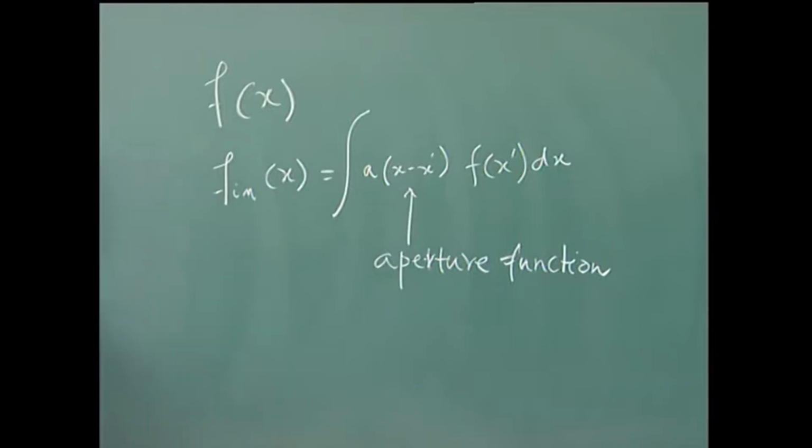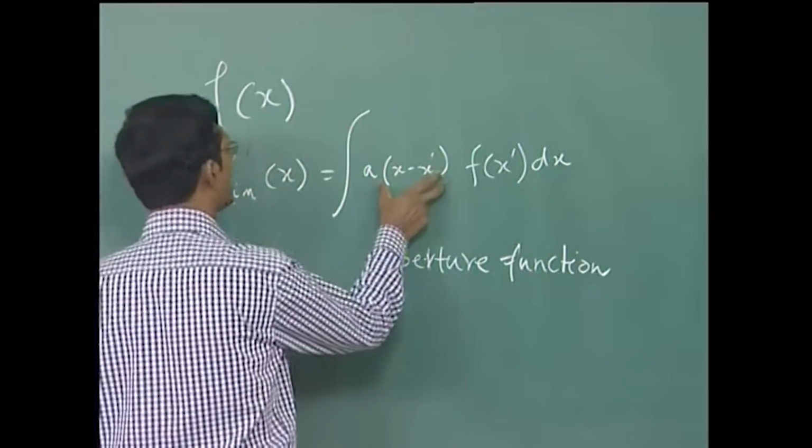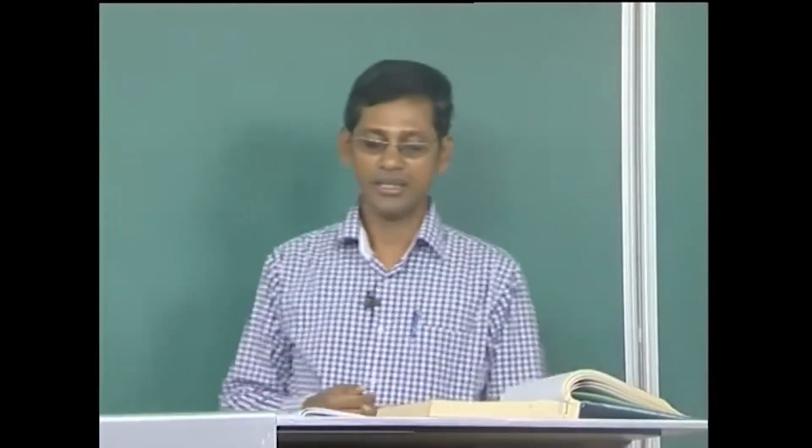That means, if I want to get the information in the image plane, we need to use the aperture function. The aperture actually modifies the image during formation.